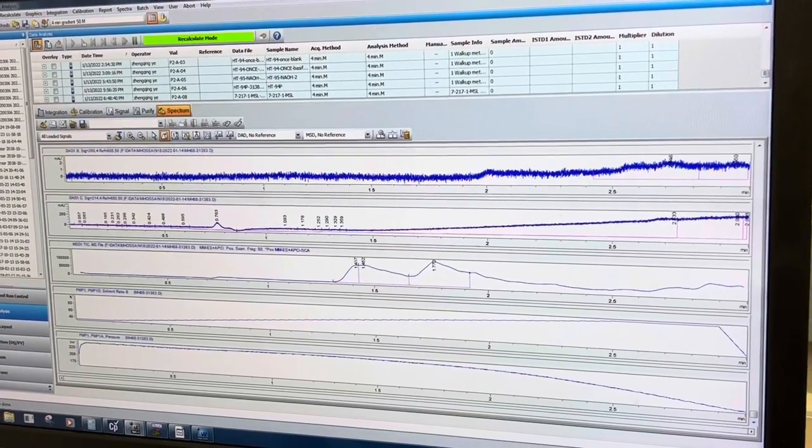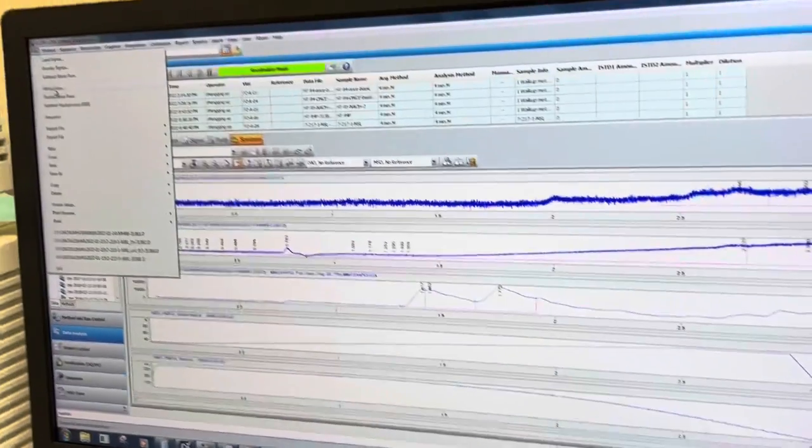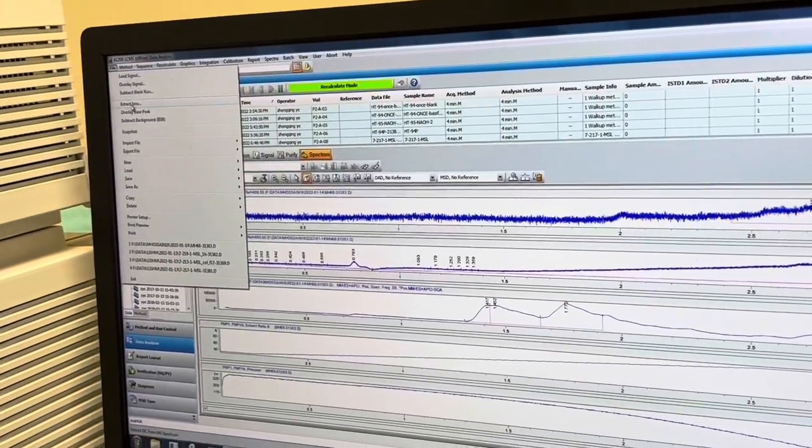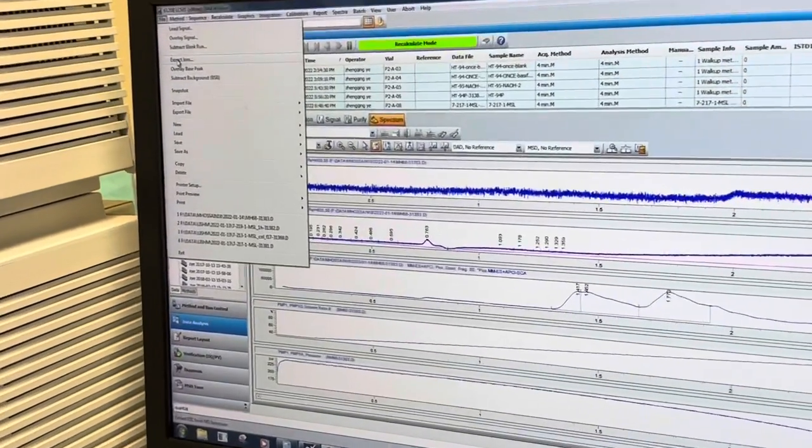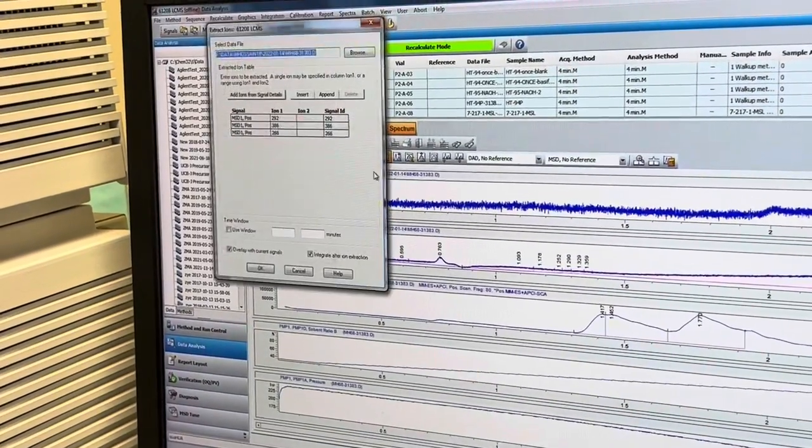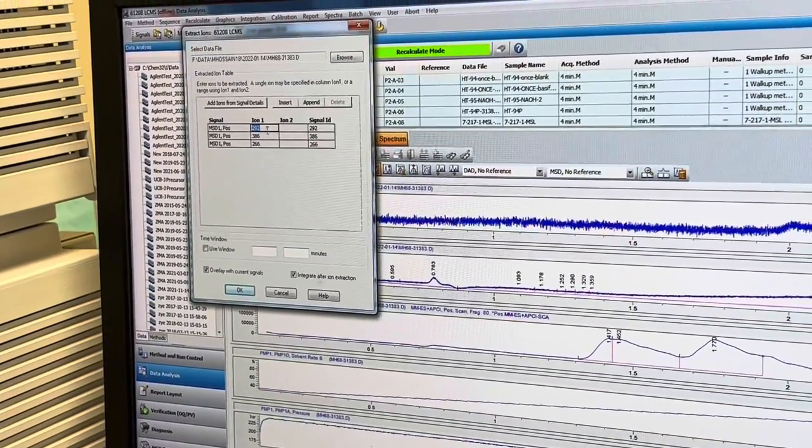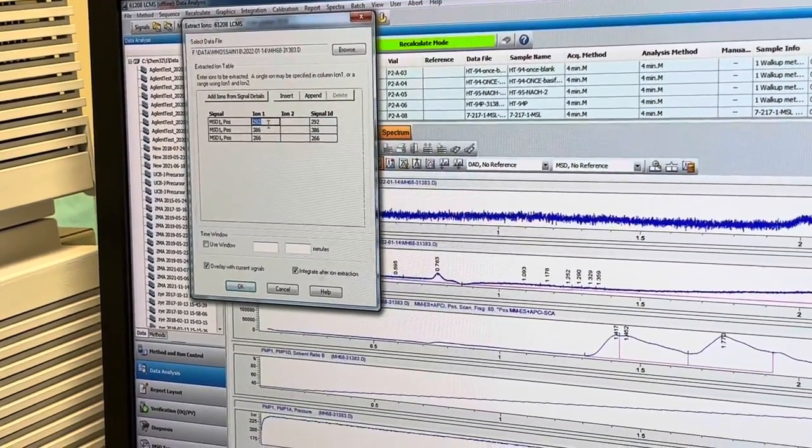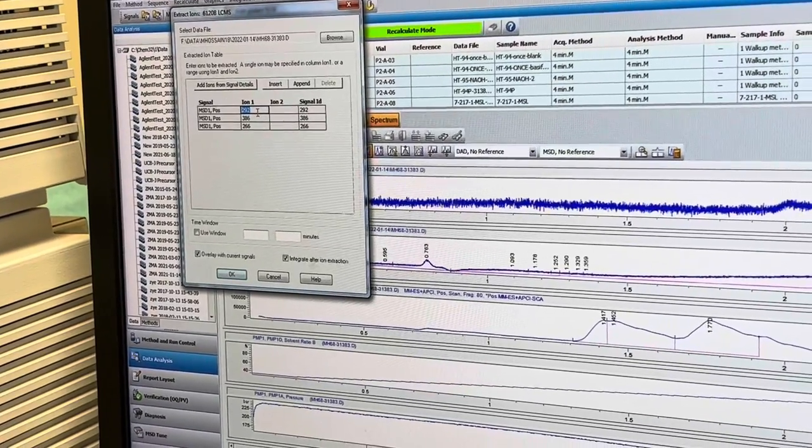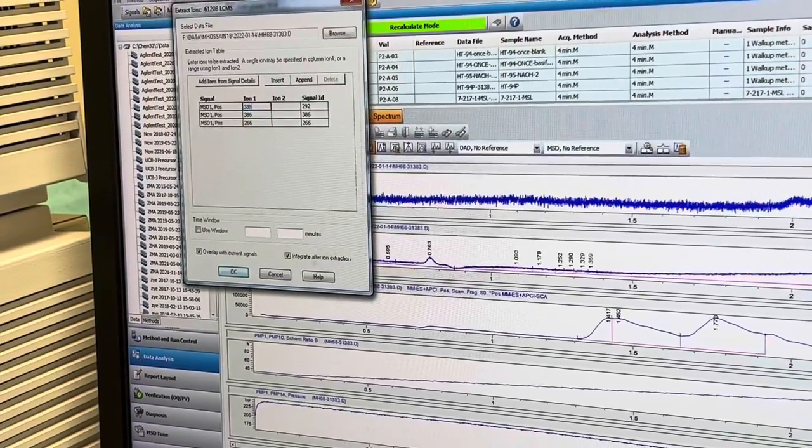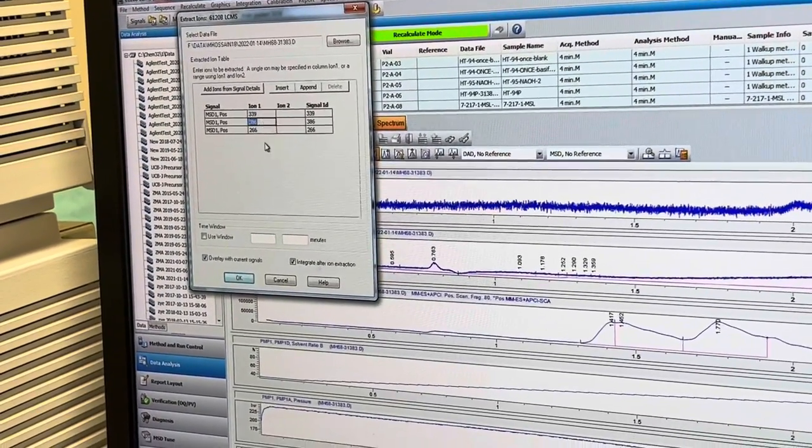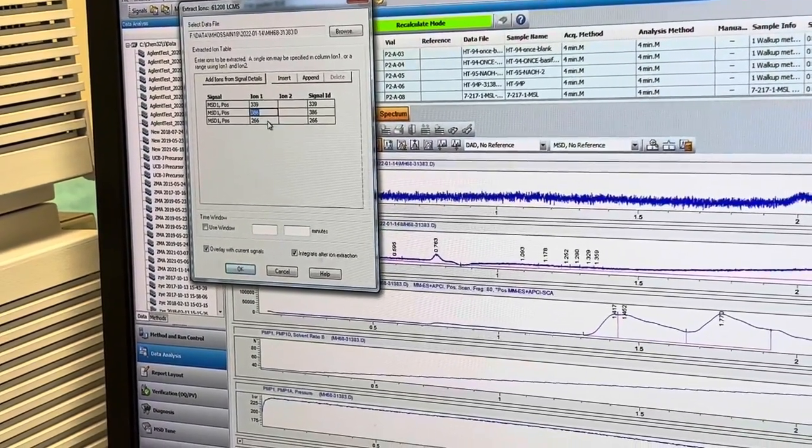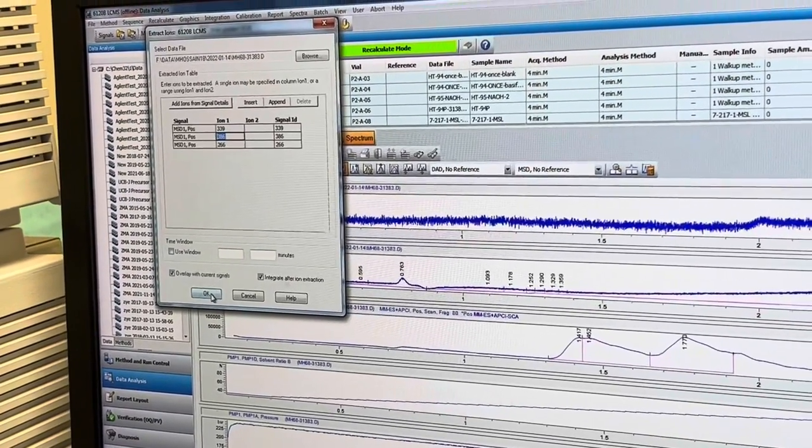So you can also do one thing, go to extract ions, file, extract ions, file, and you can also do one thing and you can put here specific ions you are looking for. Suppose I'm looking for 339.